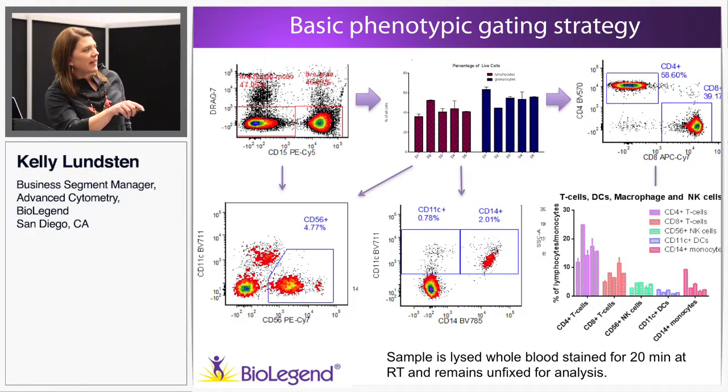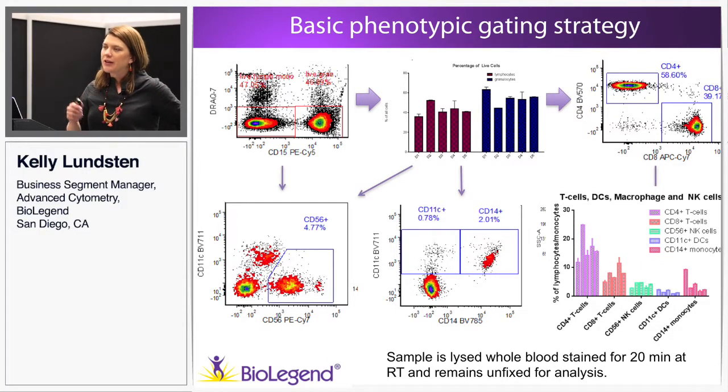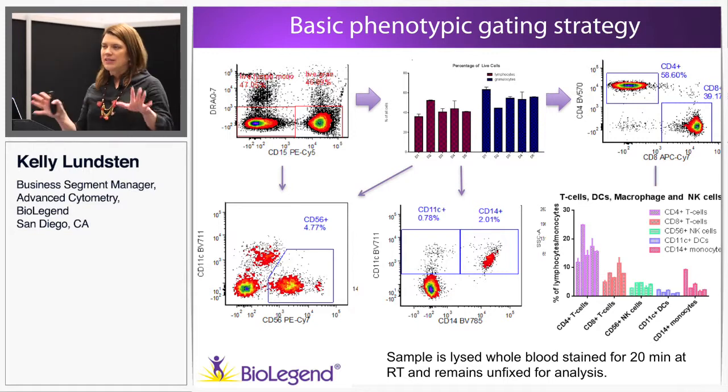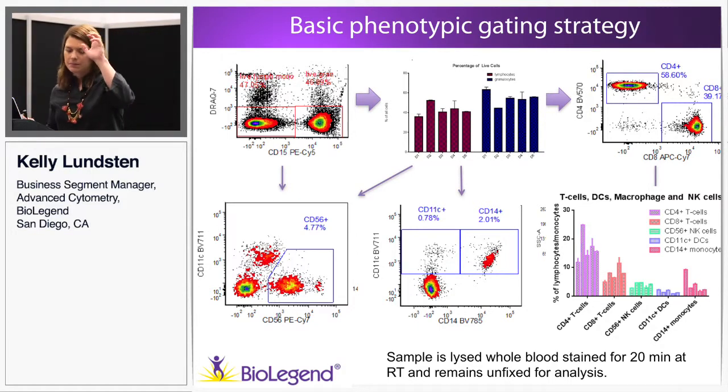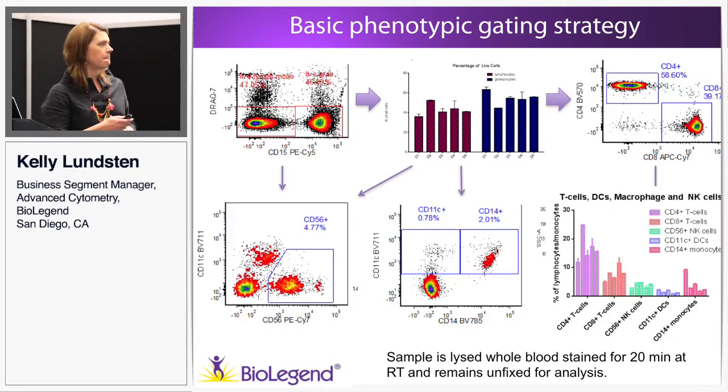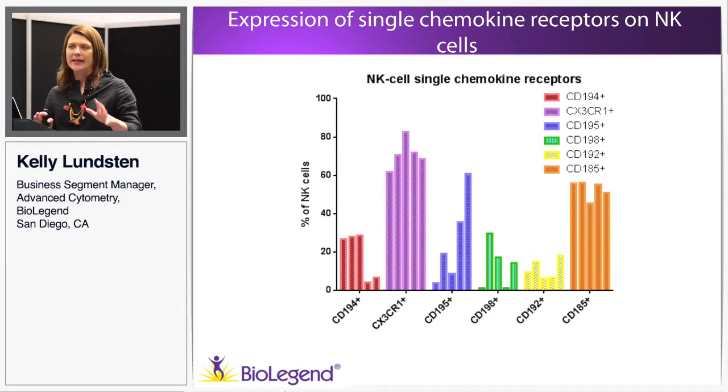So this is what this looked like. I definitely found a much greater degree of variability within my macrophage, my monocyte, my DC population, for probably all sorts of reasons. So this was actually just done on blood that was lysed first, washed. It wasn't on PBMCs, it was just on lysed washed blood. All right, so I'm gonna break it down into the different subsets that I saw.